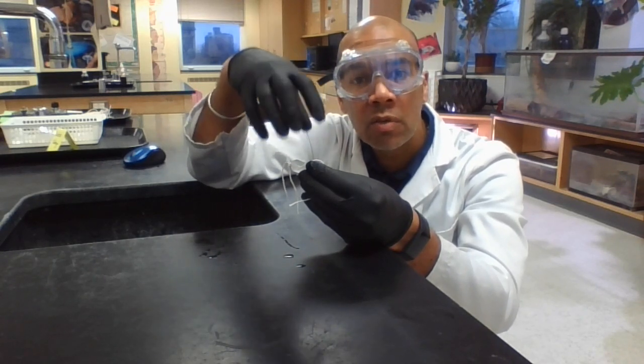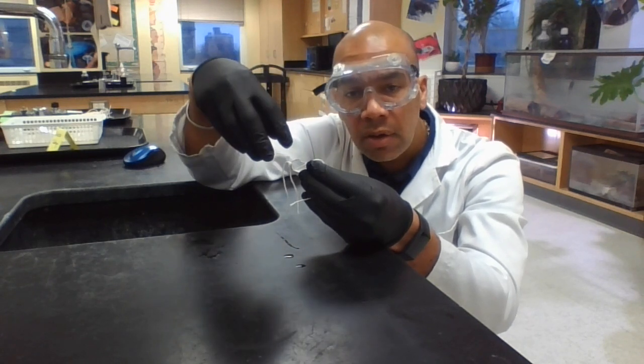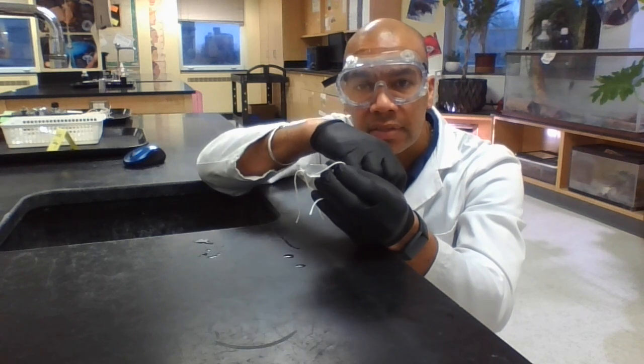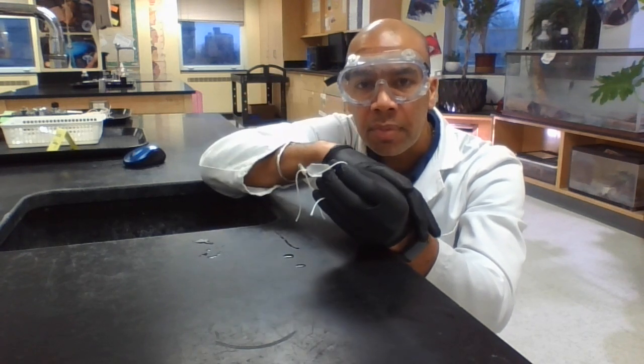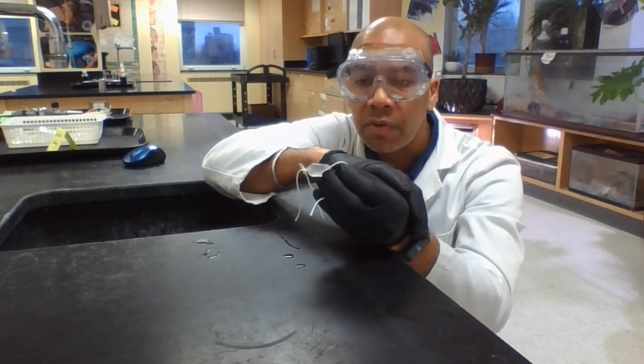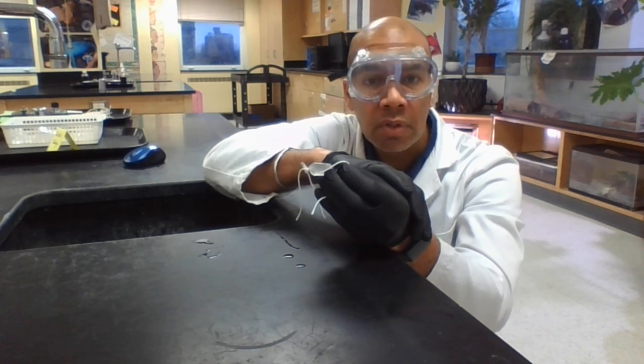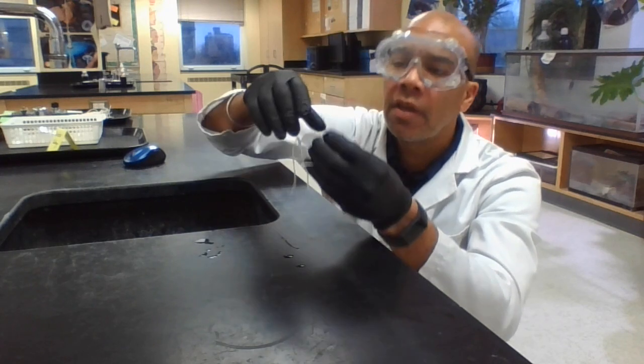And we're going to try to learn to see which items can get in or out of this bag of this small intestine. This small intestine has tiny holes in different areas that will allow certain things in and certain things out. We're going to learn what things are able to enter and exit. So how are we going to do this? Well, first, you have to do this procedure.